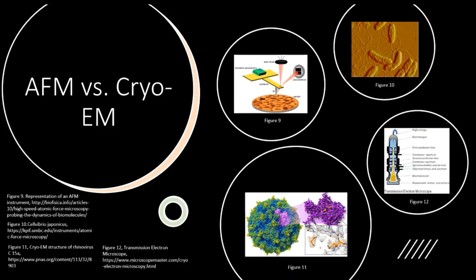Also, we have to mention that in the cryo-EM technique, the sample has to be covered with a special liquid so that the sample freezes.